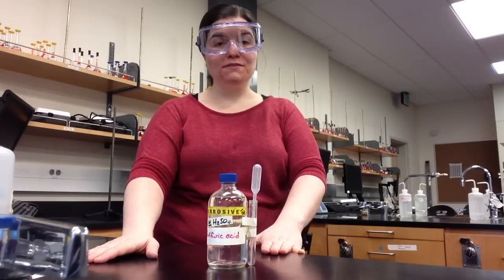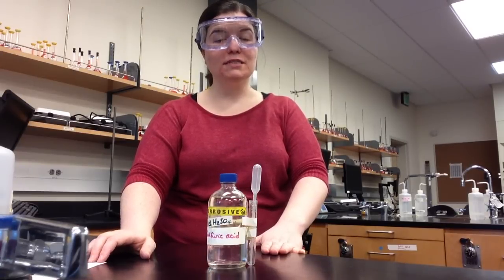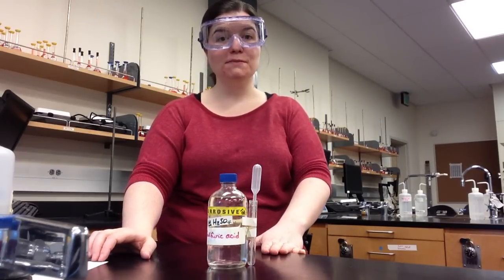If you get corrosive chemicals on your skin, wash your skin under water until all of the corrosive chemical has been removed.